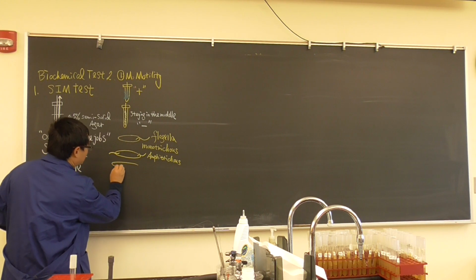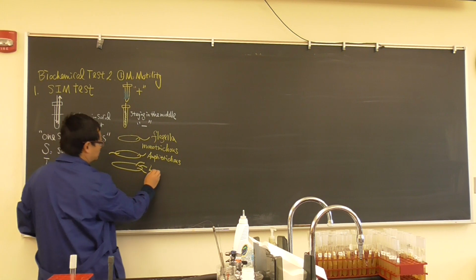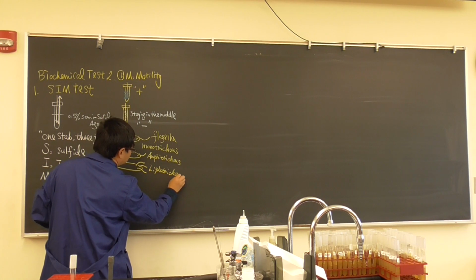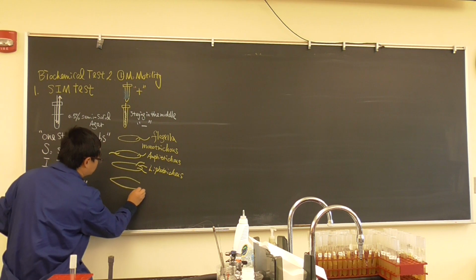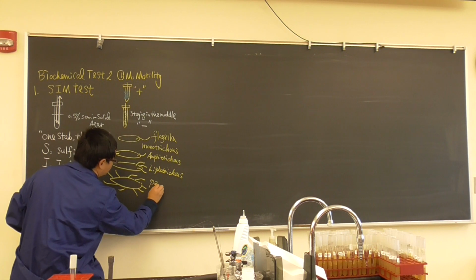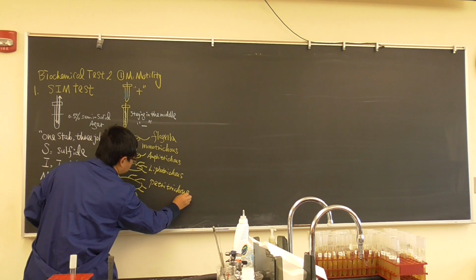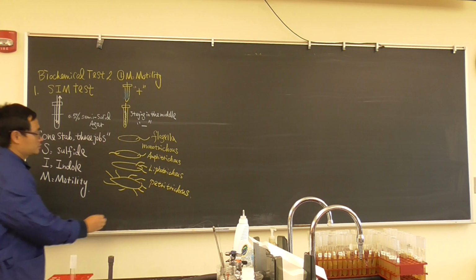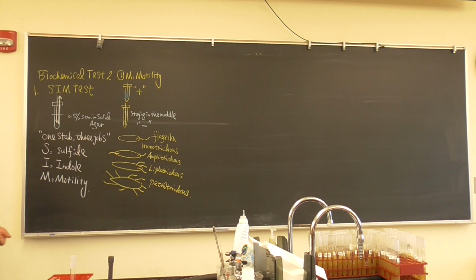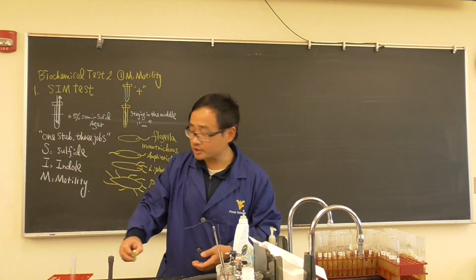If we have lots in a stack on one end, we call it lophotrichous. How about if we have flagella everywhere? Peritrichous. So we know the motility, which is real movement. So that is the first test.